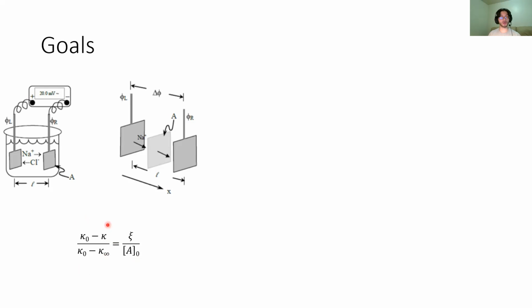So once you take this ratio, you will have a whole bunch of kappa values. We measured our conductivity at every 10-second interval, and you can turn each one of those using these three constants into a ratio here. And this ratio is just another marker of how much the reaction has progressed. So that's going to be our substitute for concentration, essentially. So at each point of conductivity that you put in, you're just seeing how far it is from the beginning and the end.